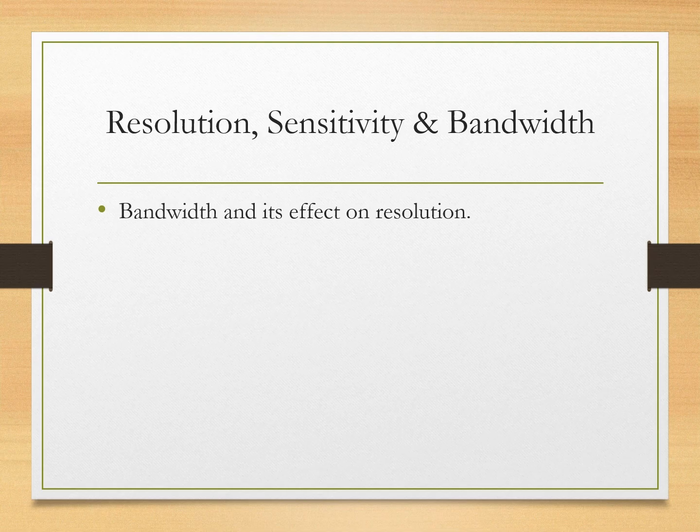We can now discuss the resolution, sensitivity and bandwidth. Spectral bandwidth determines how pure the wavelength is. Smaller bandwidth results in higher resolution. Sensitivity depends on detector efficiency and lamp stability. Sensitivity of an instrument is how small an amount can be measured by the instrument.